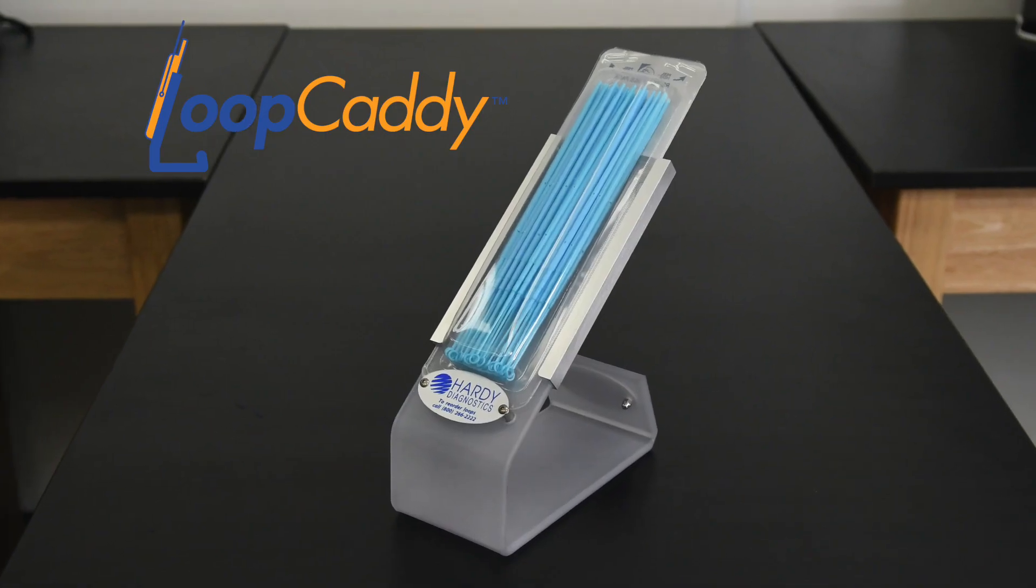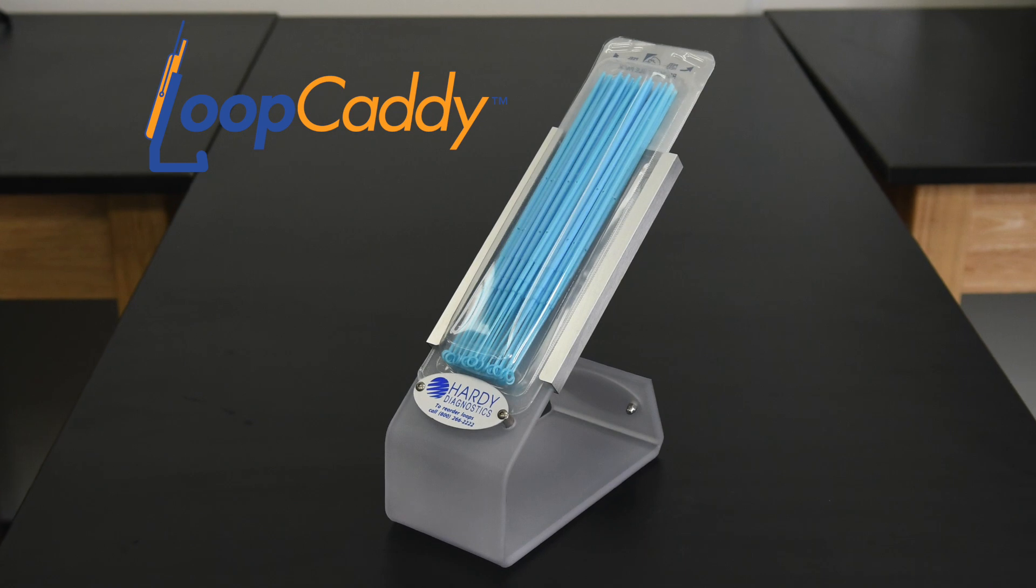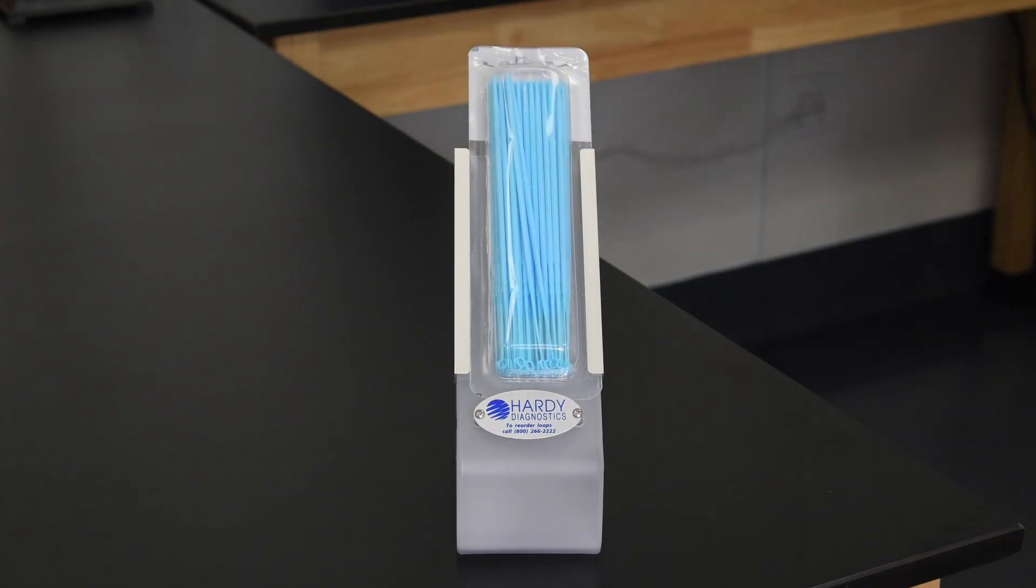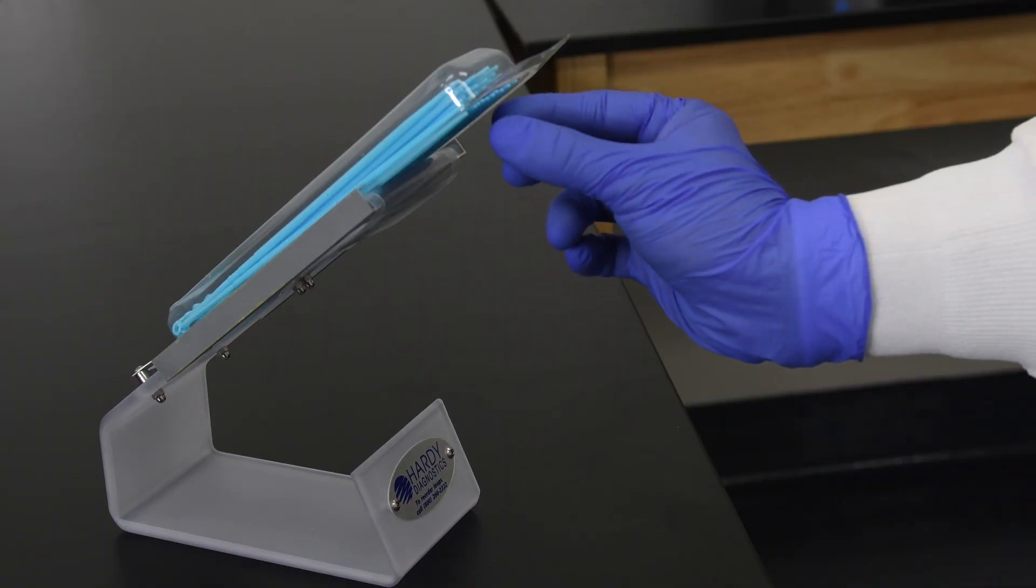The Loop Caddy system is an acrylic loop holder for use with Hardy Diagnostics resealable loop pouches. The loop pouch slides onto the loop holder, which holds it steady for easy one-handed dispensing.